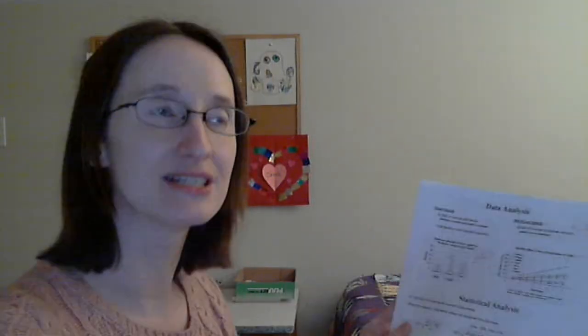So right now I'm going to focus on, if you're using a fixed stimuli, looking at a certain parameter, and if you're using a non-fixed stimuli, looking at a different type of parameter to measure. And again, you're only going to do one of these, but you can decide what makes the most sense based on your particular experiment. So if you have a fixed stimuli, something you might do is calculate the % of time that the worm is spending in the positive area, neutral area, and/or the negative area.